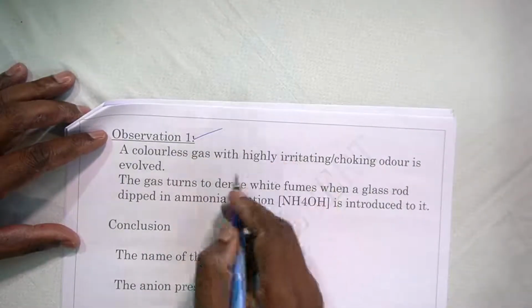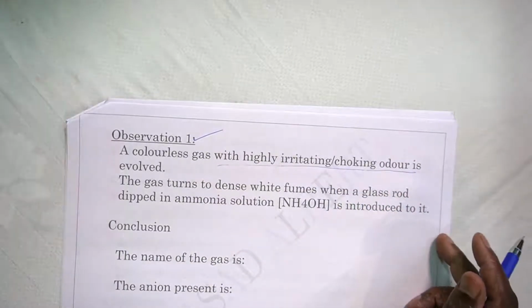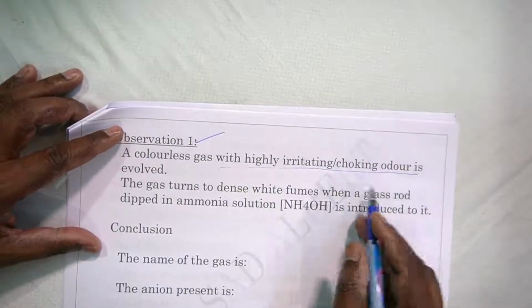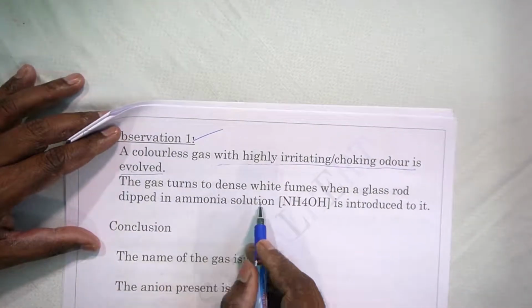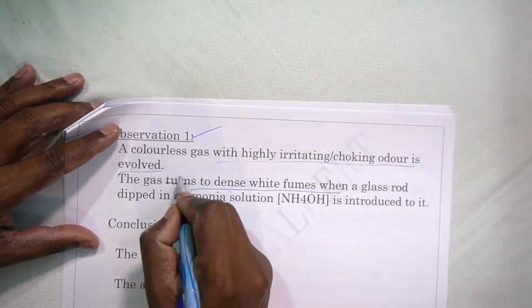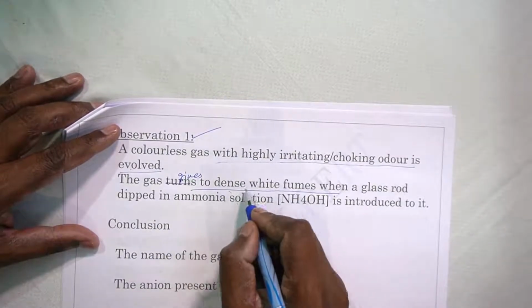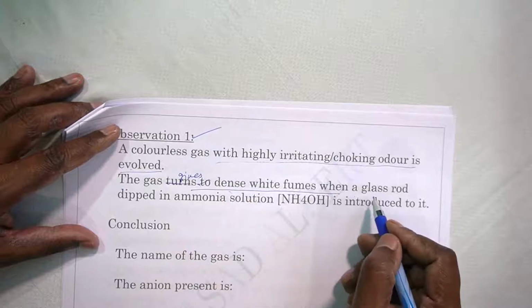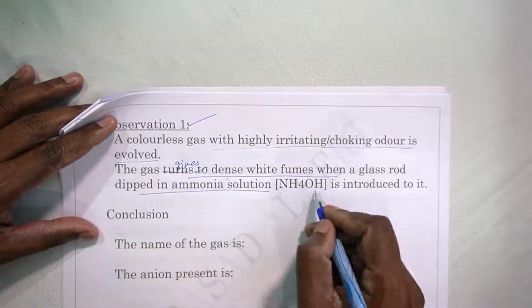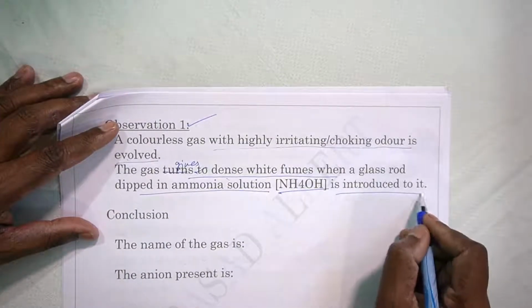The first one is a colorless gas with a highly irritating or choking odor. It will pierce your nose, you will not be able to breathe, it is suffocating, and you will cough. Such a coughing and sneezing gas comes out, and it gives dense white fumes when a glass rod dipped in ammonia solution is held near it. Ammonia solution is ammonia dissolved in water, which is NH4OH, ammonium hydroxide. It gives dense white fumes.